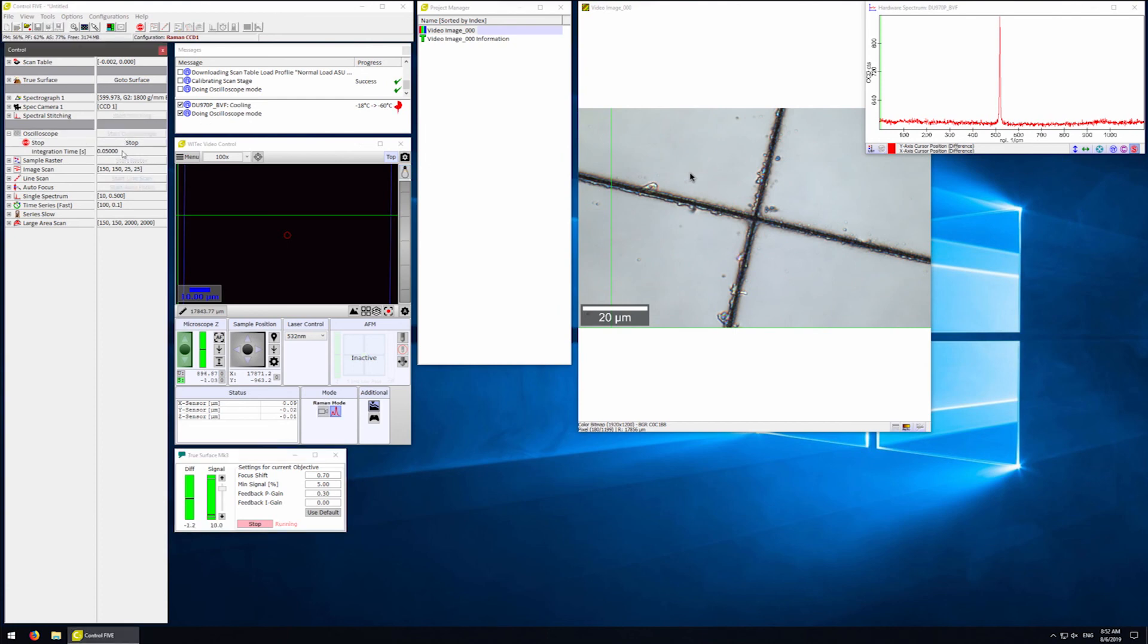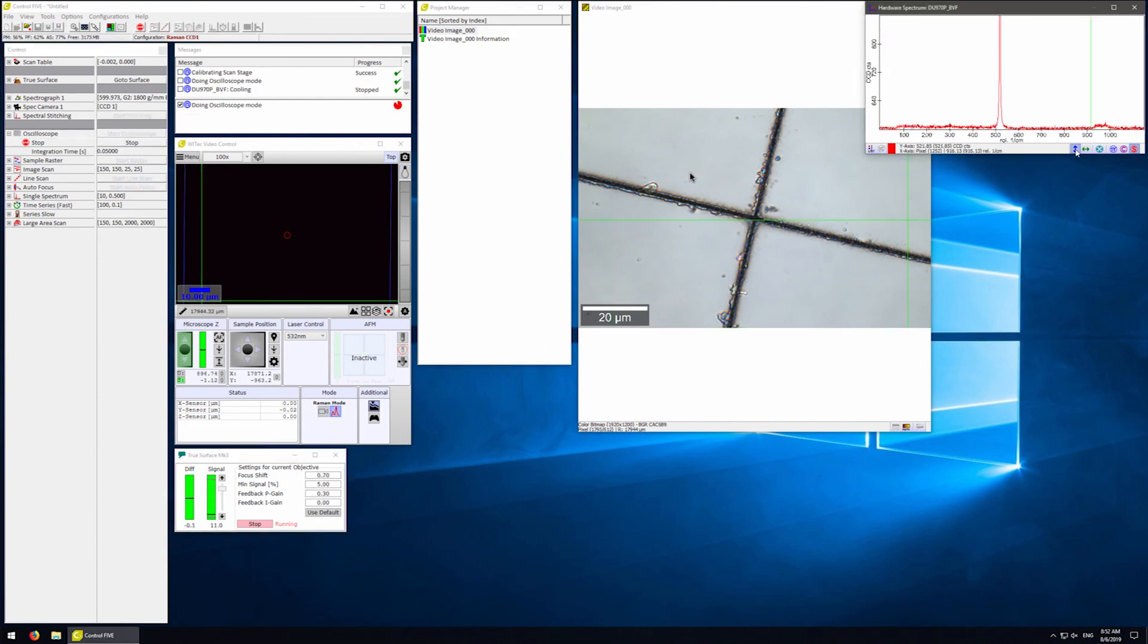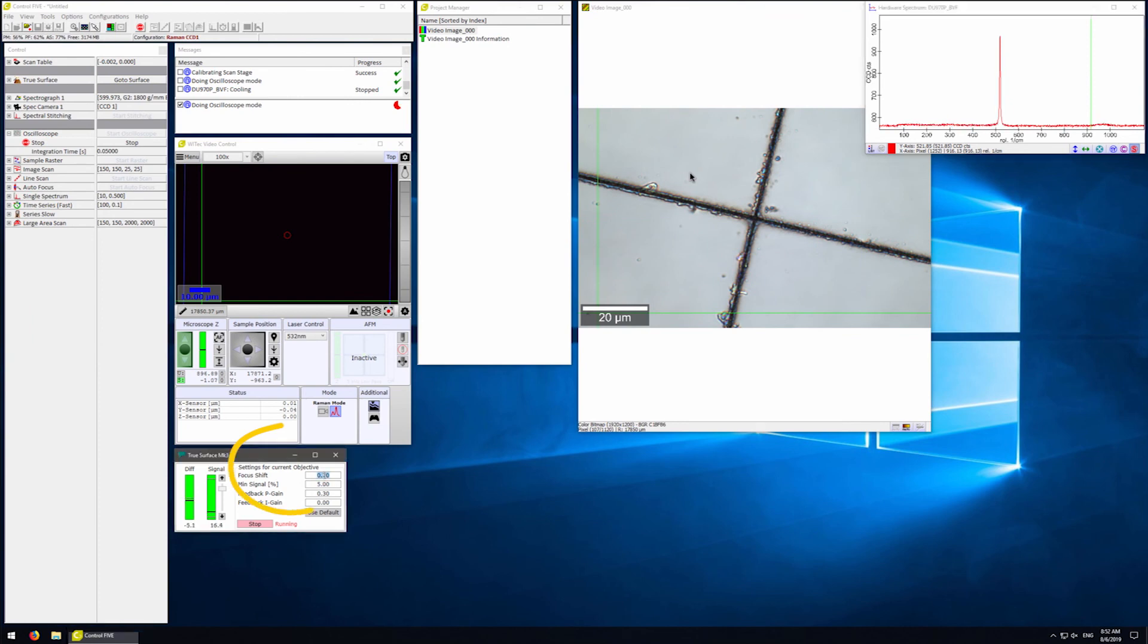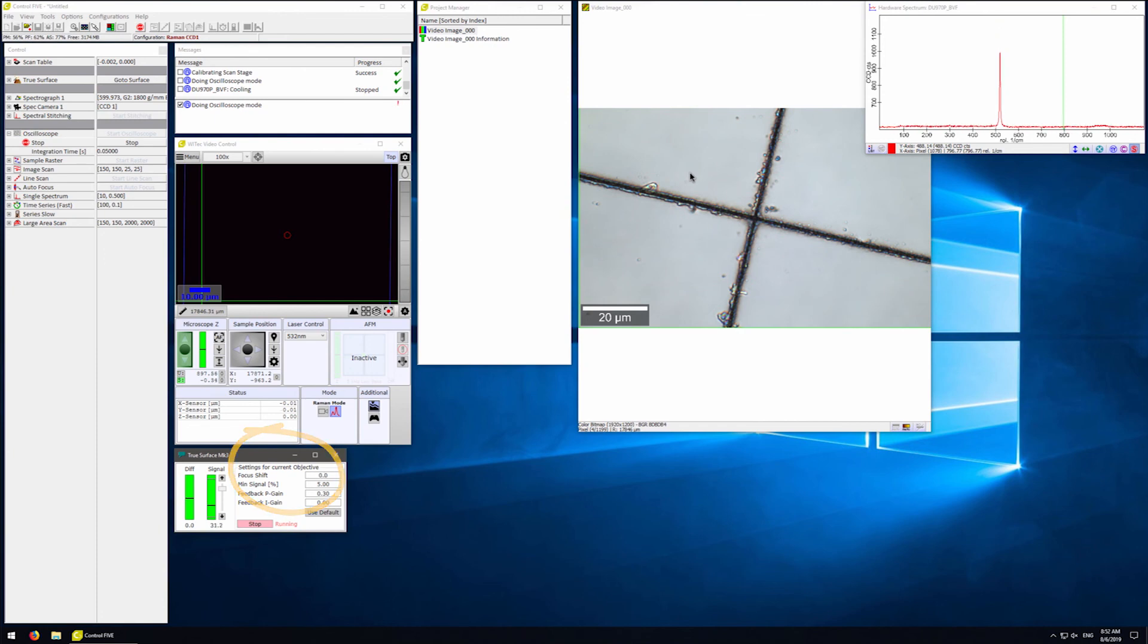Let's now restart the oscilloscope mode. We want to adjust the focus shift. This is the shift between the optical focus of the sample and the TrueSurface focus of the sample. We are all set once we have maximized our signal. We can now set up our large area scan.